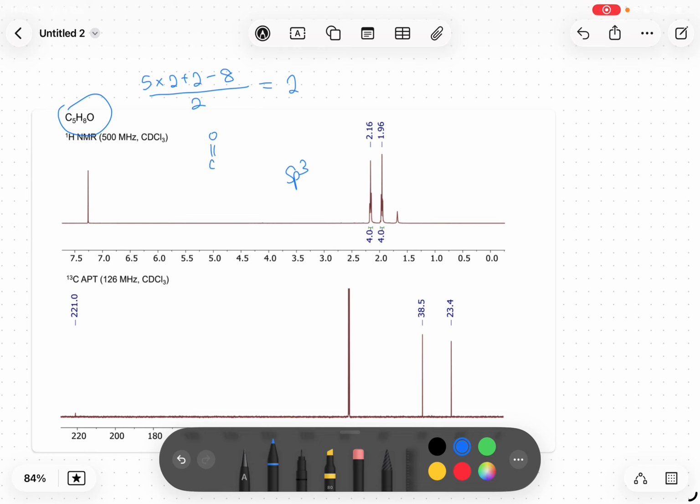So how large is the ring? We see that we have 2 peaks, each of 4 protons. So we know that 4 protons are equivalent to each other and the other 4 protons are equivalent to each other also. That implies a degree of symmetry inside the molecule, and we can just have a think about that, and the easiest solution we can come up with is this one.